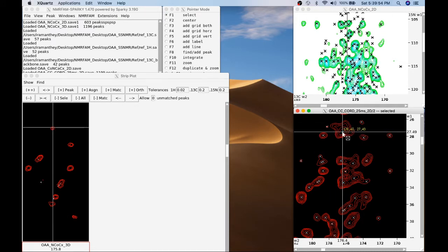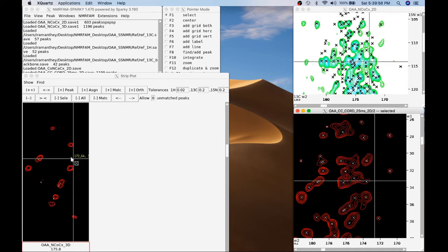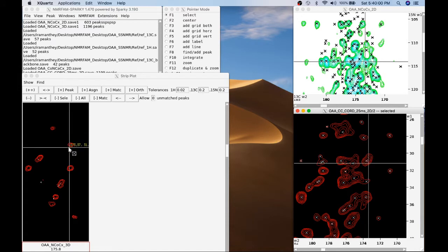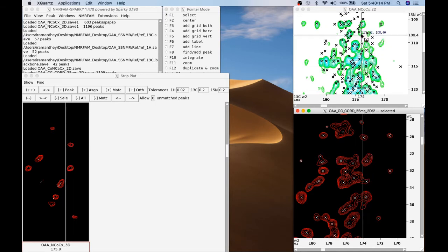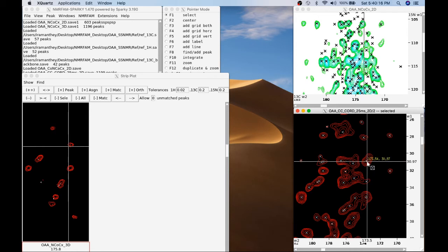And so that is one that we can consider a success and we can transfer over. But we're also going to look at the rest of these signals that do not have peaks on them here. We can see this one's fairly close, but it is just off of that signal, and this could be a peak resulting from somewhere else in a different nitrogen dimension. And so I'm going to go ahead and leave this out.